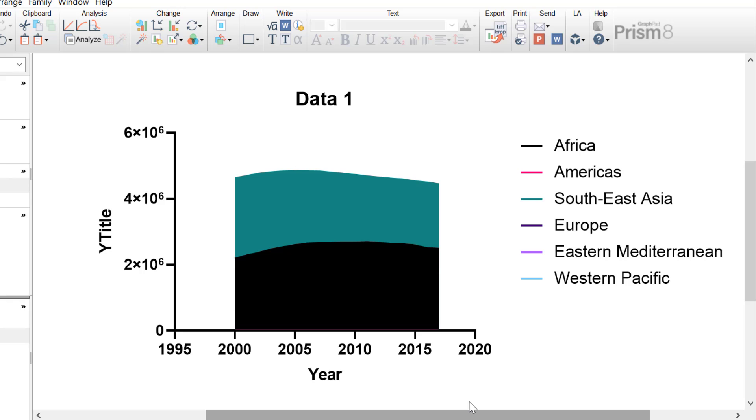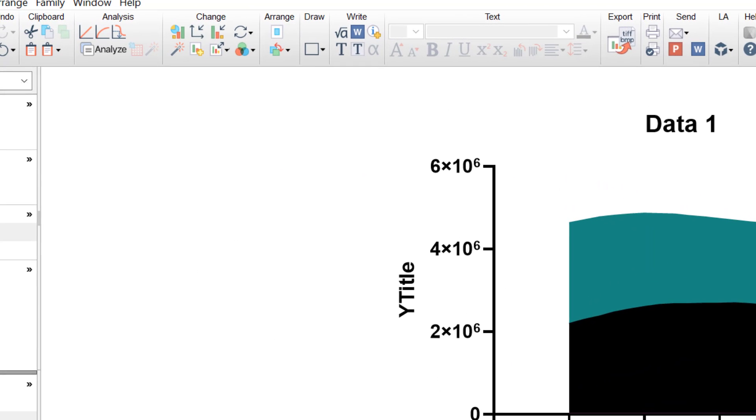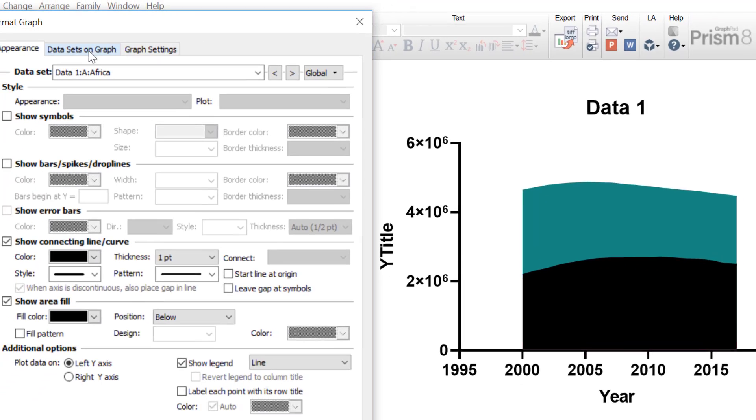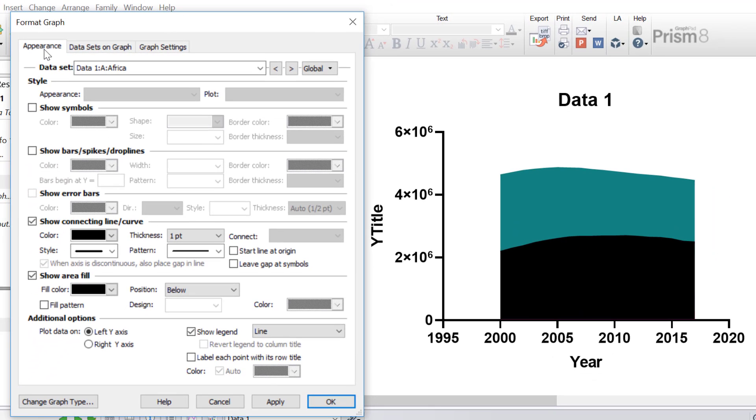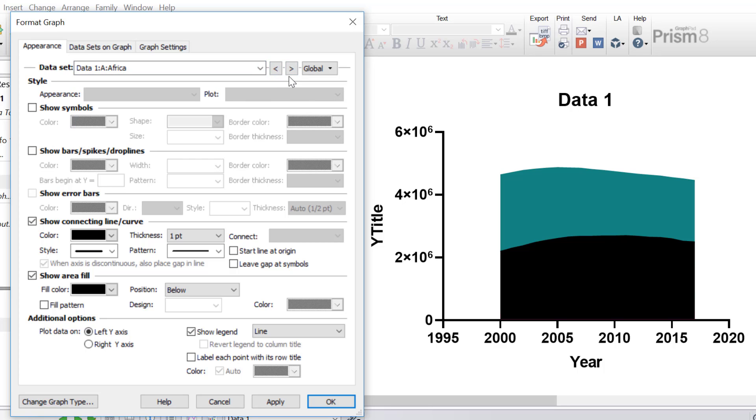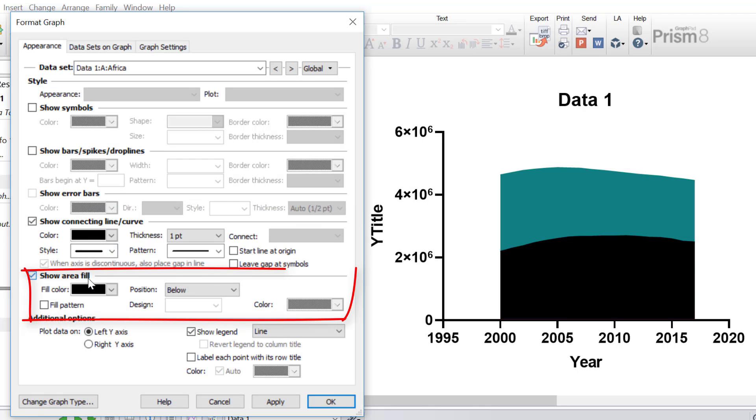So to change the appearance of the area graph in more detail, you want to click on the Format Graph button at the top, and with the Appearance tab open, you can switch between the datasets by using these buttons here, or by selecting the dropdown here. The aspects that you'll be interested in changing on an area graph are usually the Connecting Line and Curve, where you can change the color, the style, the thickness and the pattern, and the Area Fill option, where you can actually change the area fill color of each dataset.